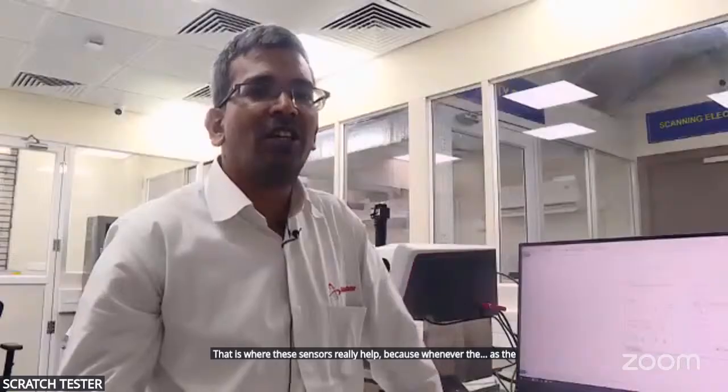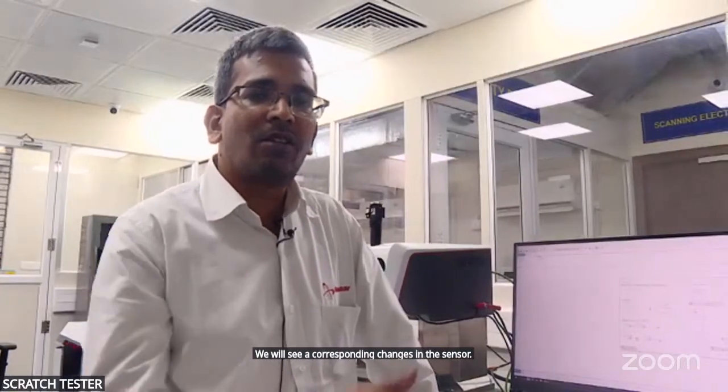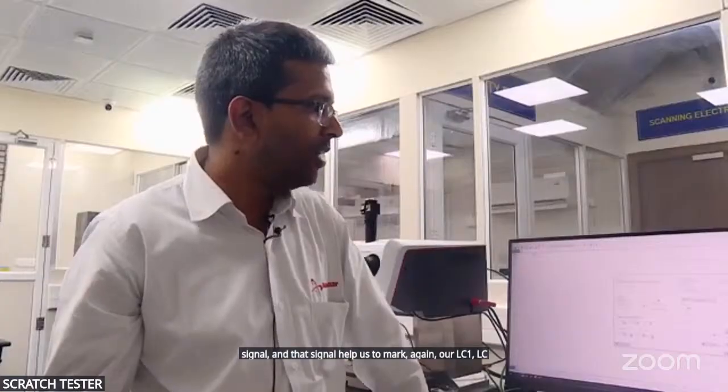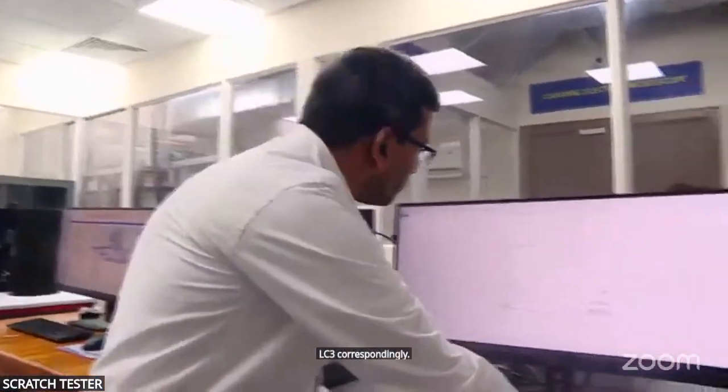That is where these sensors really help, because as things change, we will see corresponding changes in the sensor signal, and that signal helps us mark our LC1, LC2 and LC3 correspondingly.